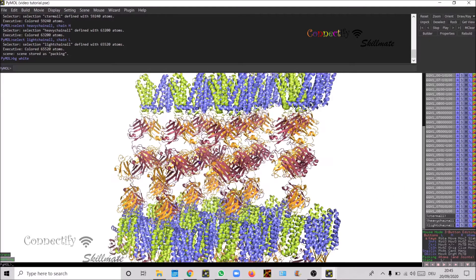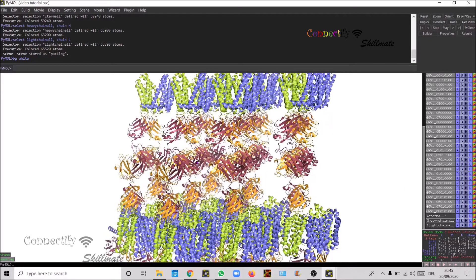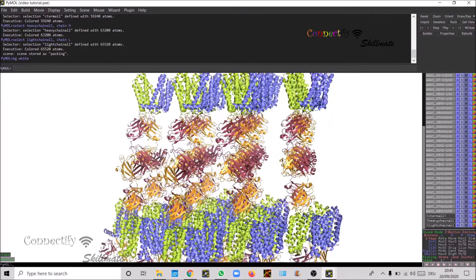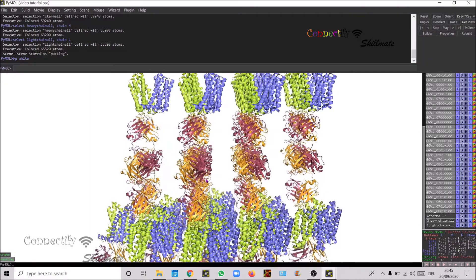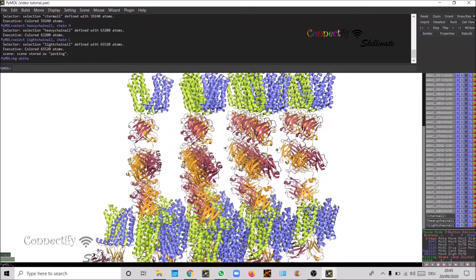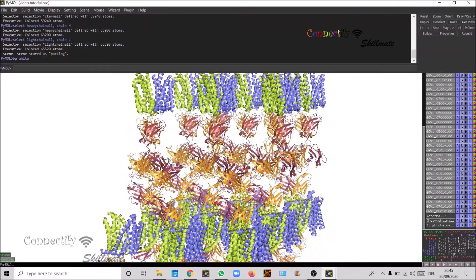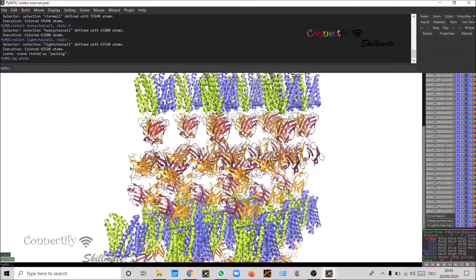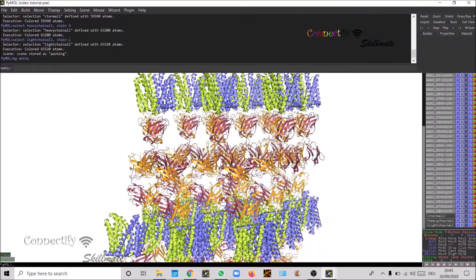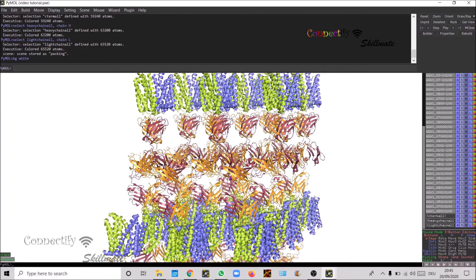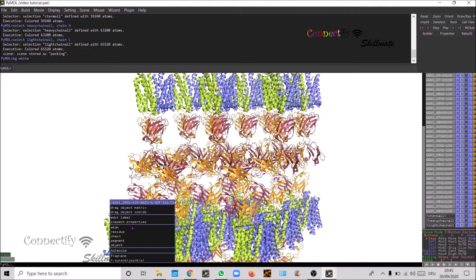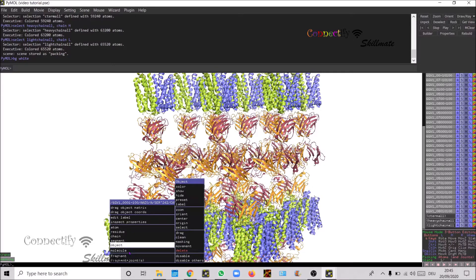This would change the background to white. Now you can see the packing. Now you can still play around this one to see which view and which molecules to remove. Probably this is an odd one so you can remove this molecule out.